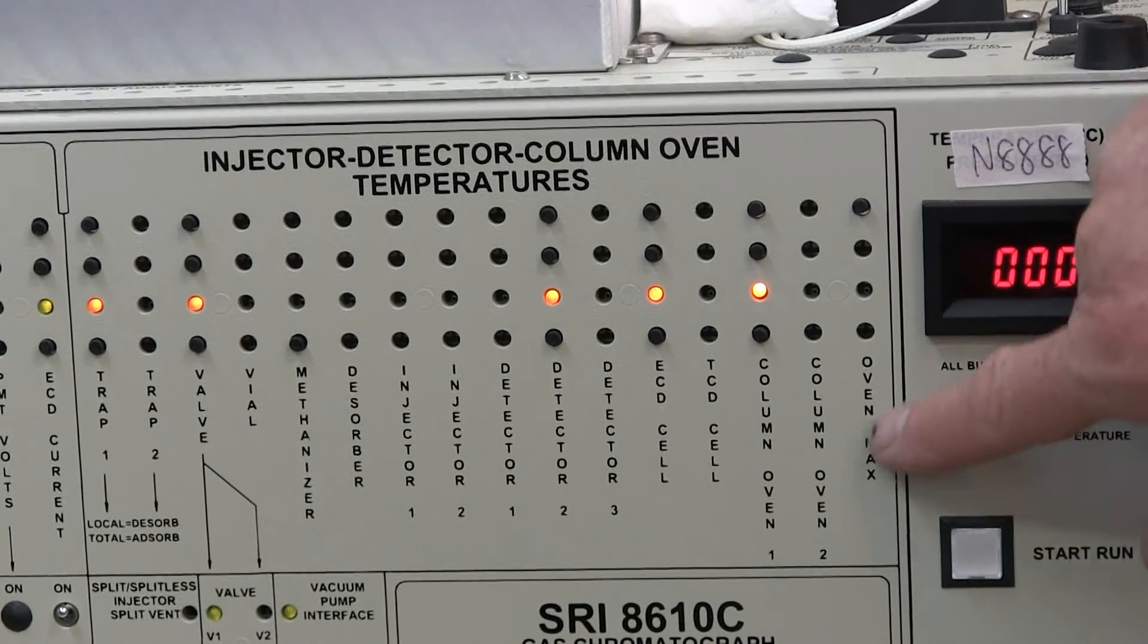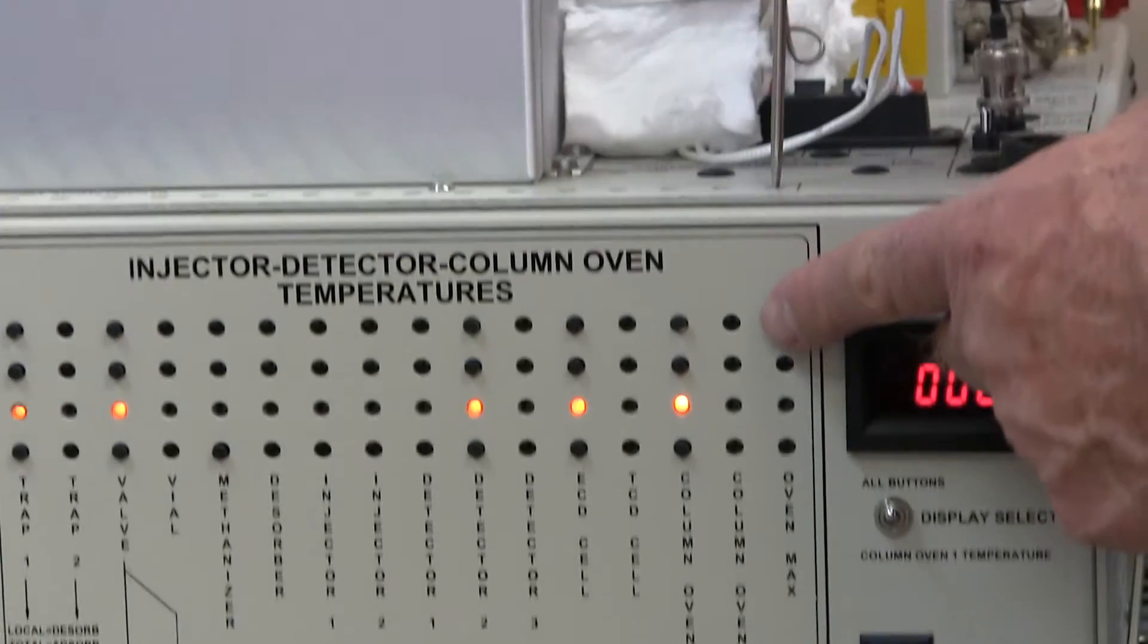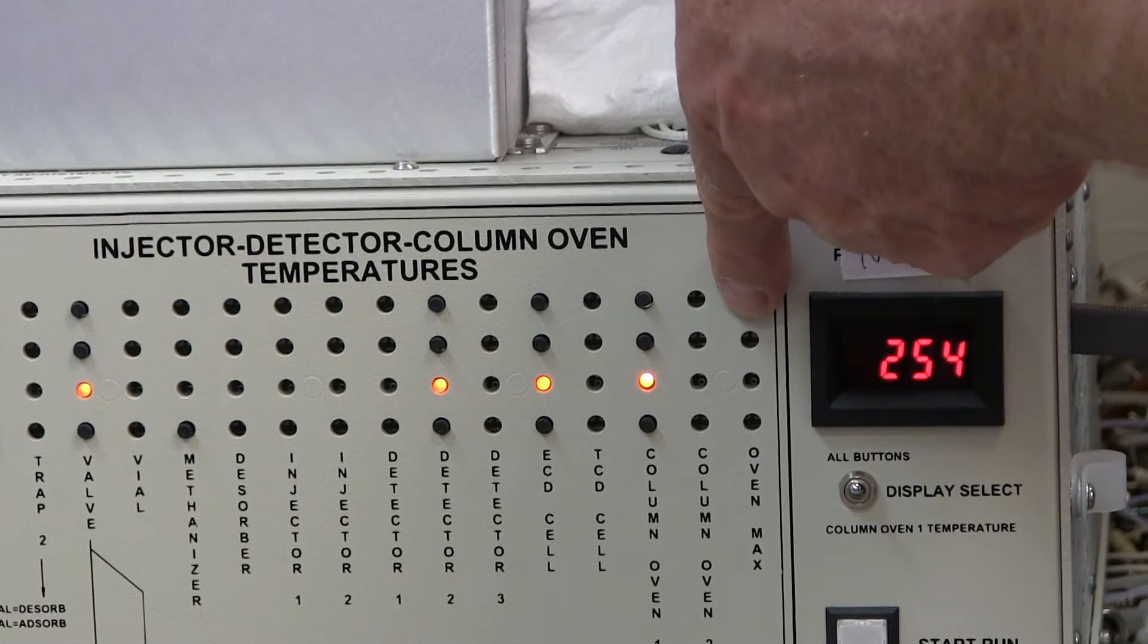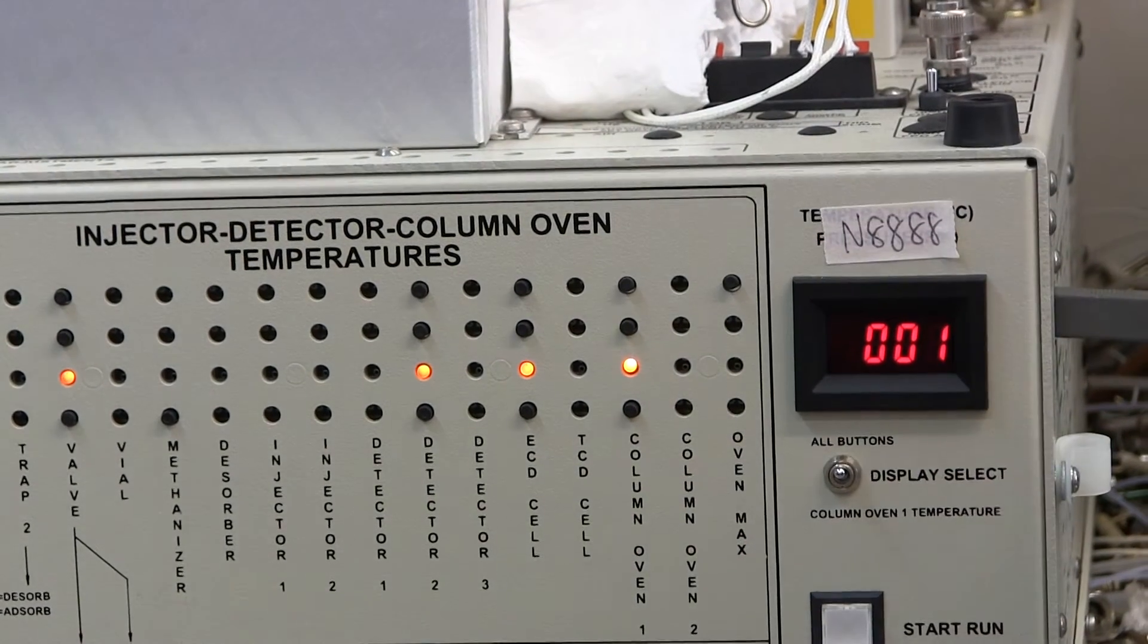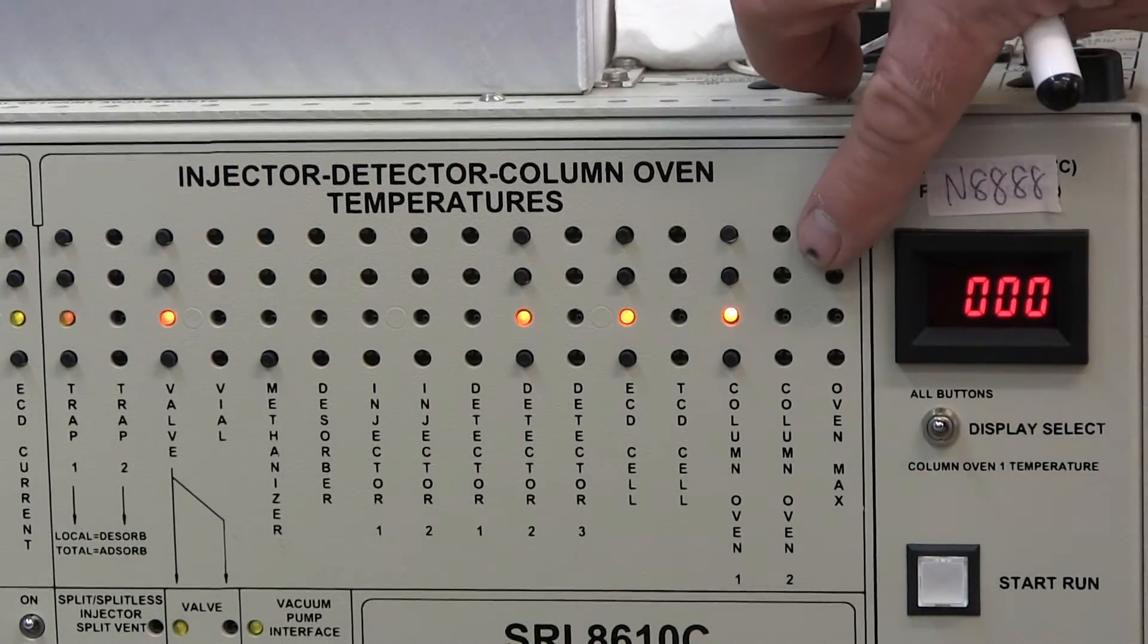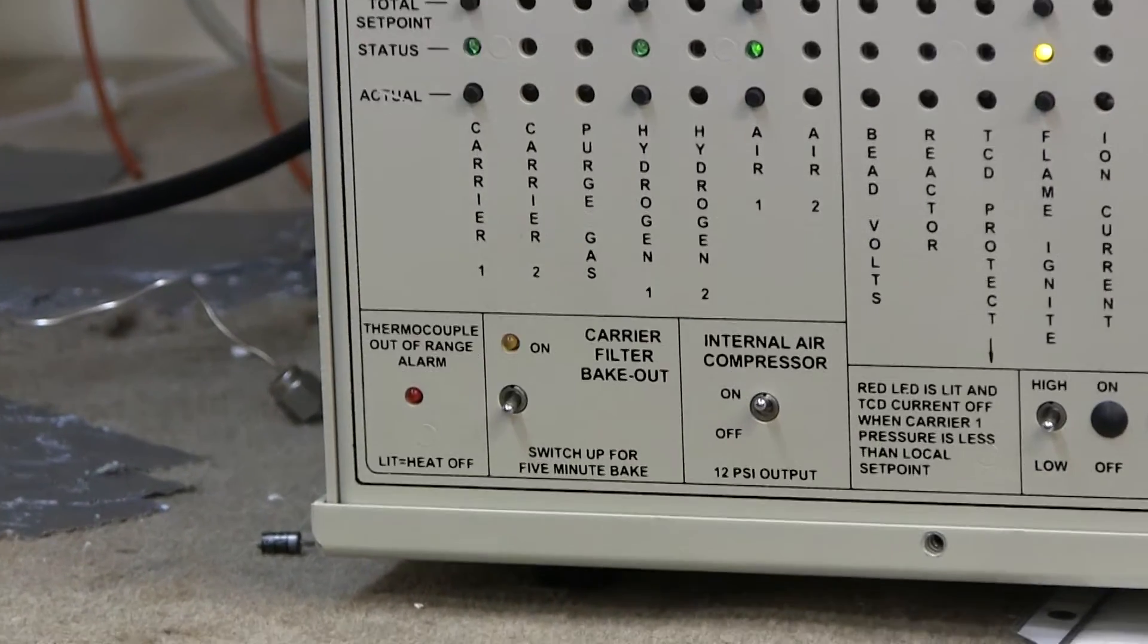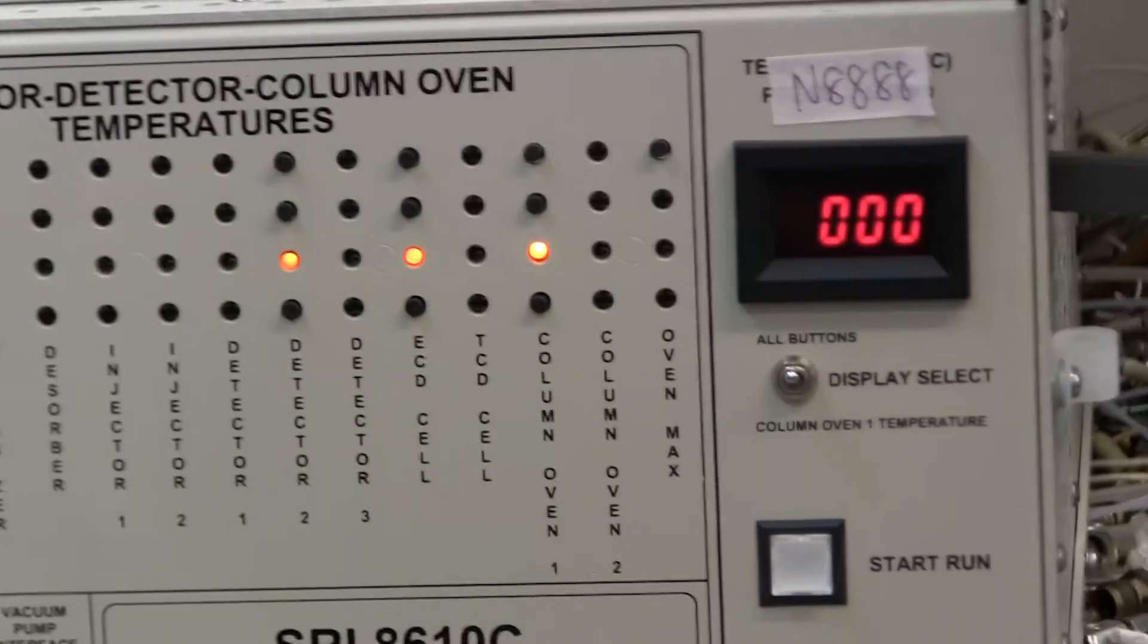This last button here labeled oven max is a safety feature. If you set this temperature with your screwdriver, and you have a column in your column oven that has a maximum safe temperature of 250 for instance, then you might set the oven max at 255. That way, if you make a mistake or somebody new comes along and raises the temperature beyond the safe limit, then there will be an alarm that sounds. That's this red light here in the bottom left, called the thermocouple out of range alarm. If you try to heat the oven above the oven max, then this red light comes on and it turns off all the heaters.